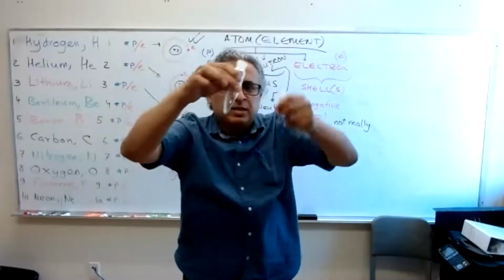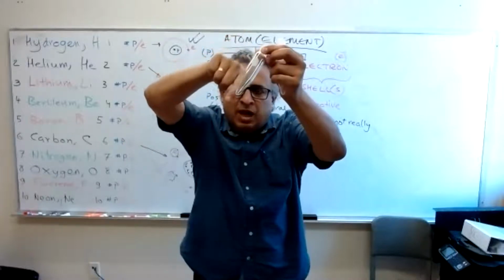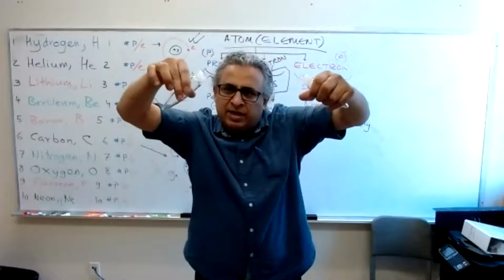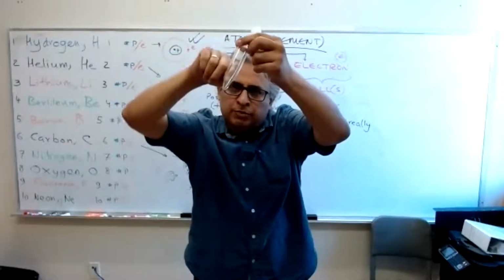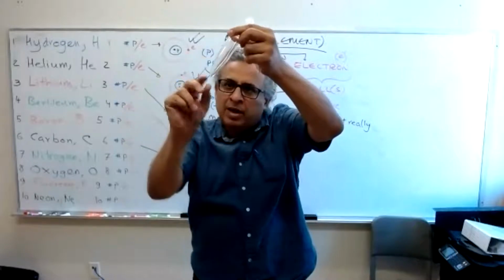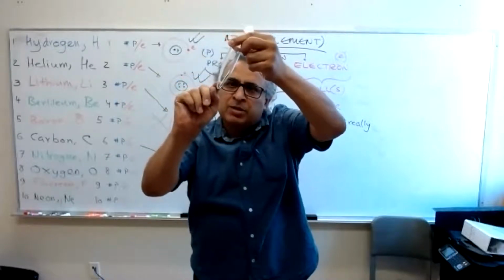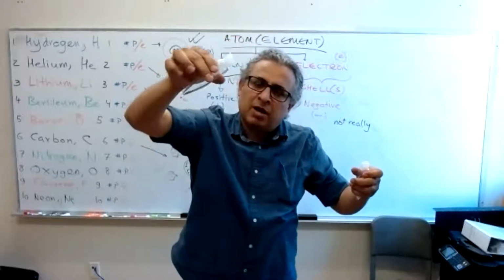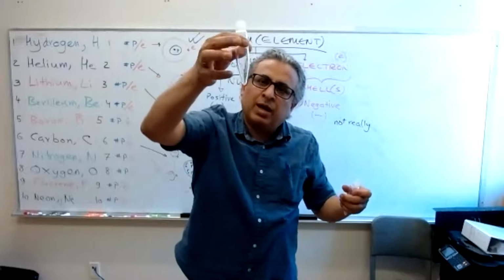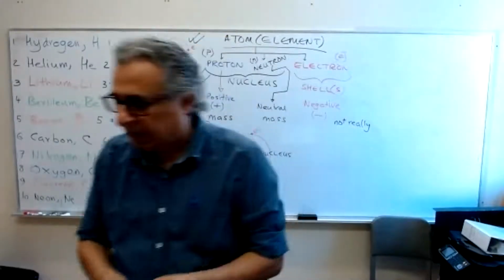As it spins, the centrifugal force pushes the solid down here because they're slanted, kind of like this. The solid gets stuck at the bottom like a little cake, and the liquid becomes a clear liquid on top of it. Once your centrifuging is done, you pour out the liquid and you have the clean solid at the bottom. So this is what a centrifuge tube looks like.